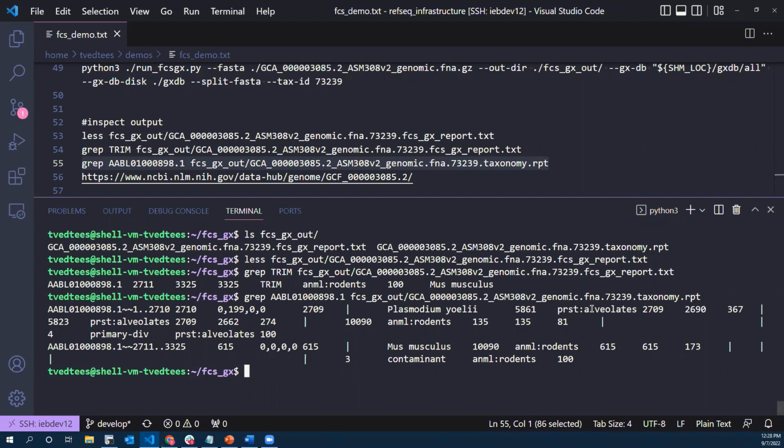The advantage here is that if closely related organisms share common contaminants, GX reporting multiple divisions can potentially distinguish between valid contaminants and artifacts due to shared contamination. The double tilde symbols in the sequence identifiers indicate that this particular sequence is assigned as chimeric by GX.